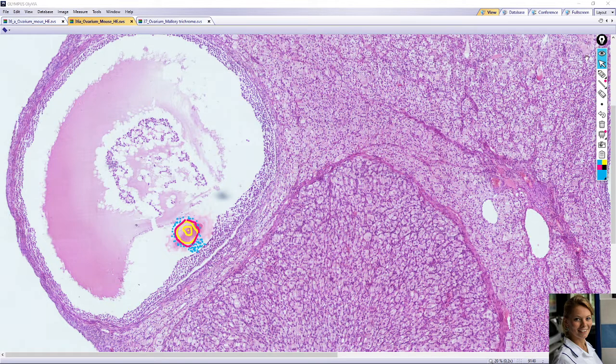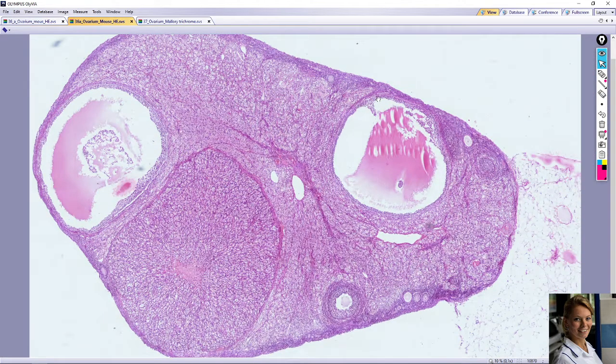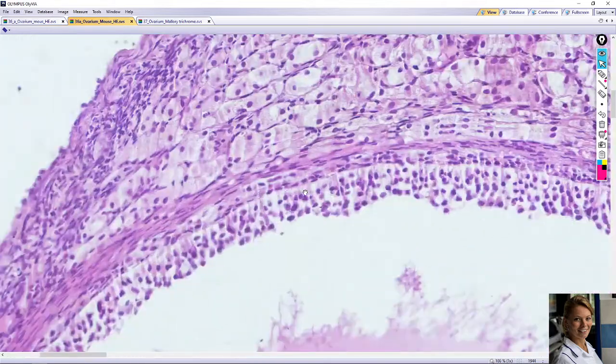So, and here is a membrane, basal membrane, or membrane of Slavjansky, and here is a theca interna and externa. So this is the mature follicle, or Graafian follicle. It's a very big structure located deeper in the cortex. So here it's a detail.